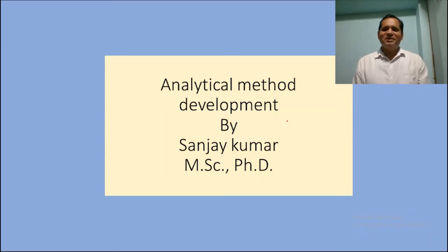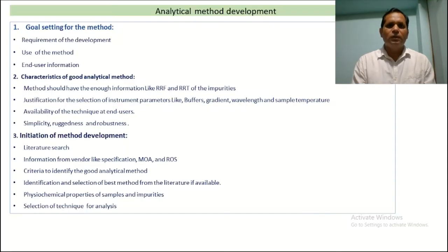I'm going to upload this video about analytical method development and how to start the development. When we are going to start any method development, before starting, we have to keep some points in mind that we need to be aware of.